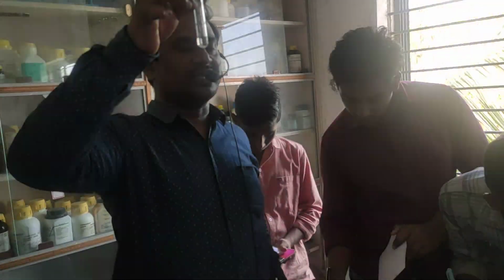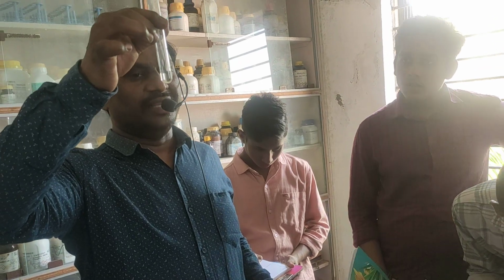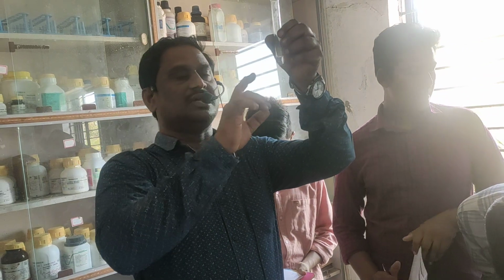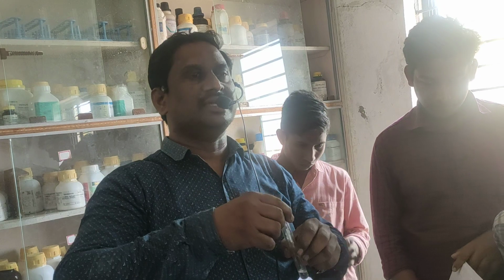Now we have to detect the acid radical. Keep heading, all of you: Problem number 2. Identification of group for acid radical or anion. Acid radical we also call anion. In the given salt we have to identify the cation and the anion. First we are identifying the anion.